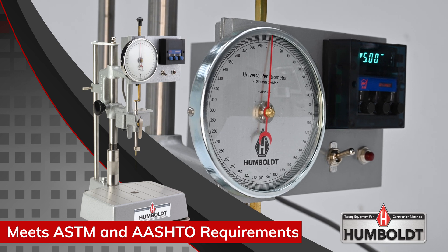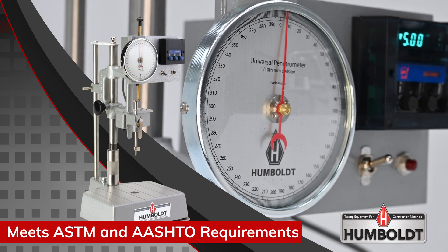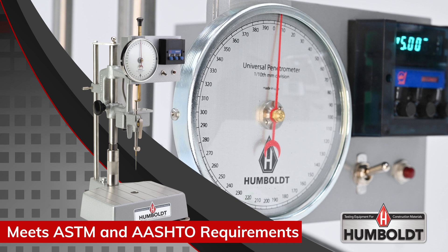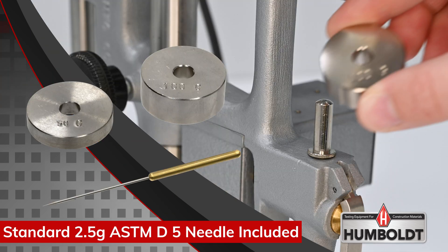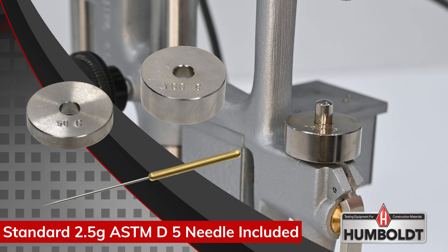The H1240 electric penetrometer takes our universal penetrometer and adds an automatic digital timer to it. All penetrometers are supplied with a standard 2.5 gram ASTM D5 needle and two additional loading weights.